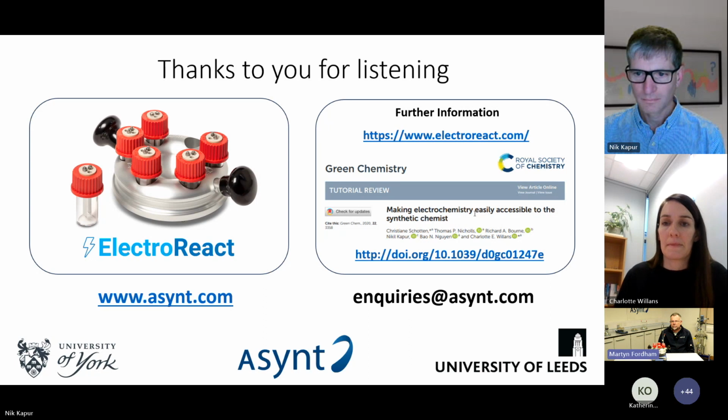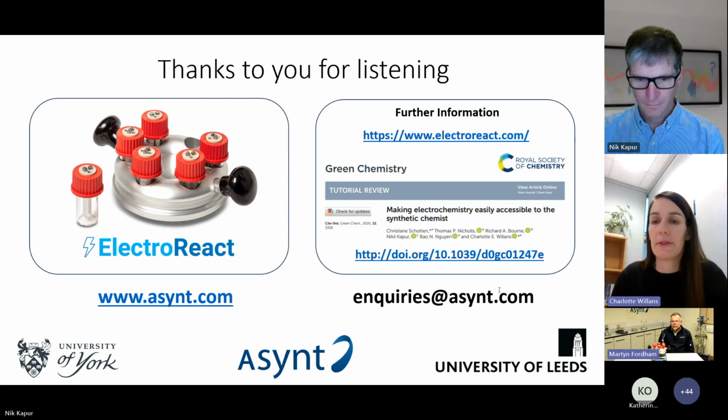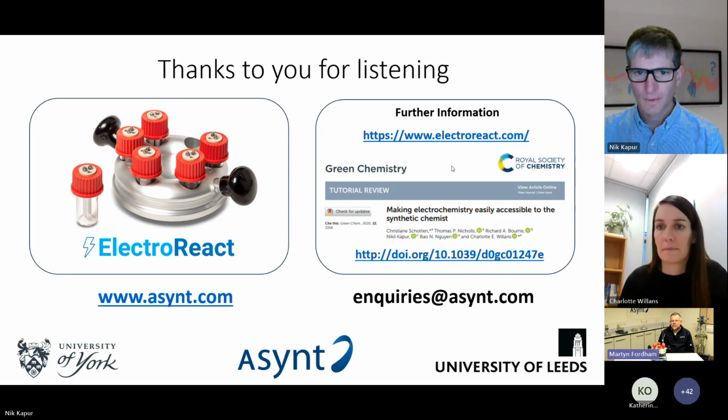Thank you, Charlotte. I think we've got a question coming on the chat regarding cyclic voltammetry. The software has to come from the potentiostat being used. Is that correct? Yes. Yeah. So different potentiostats will come with different software. So yes. I think that might be it then for questions.